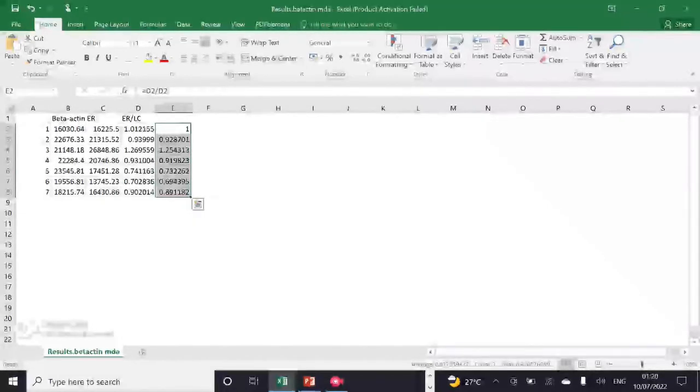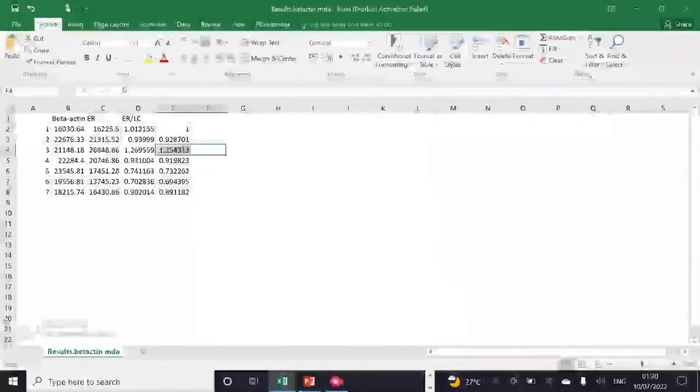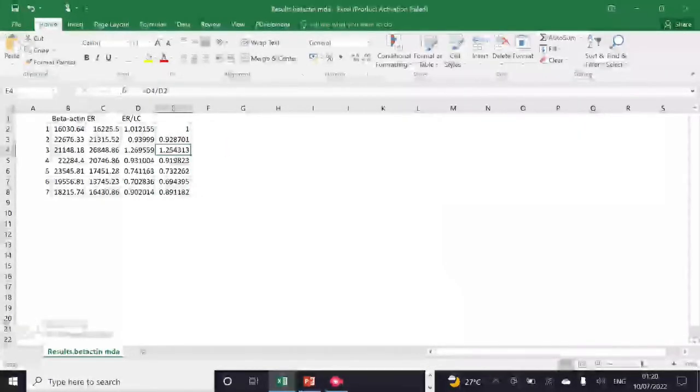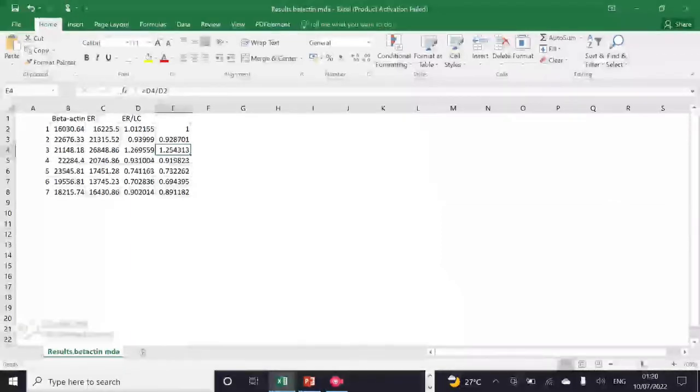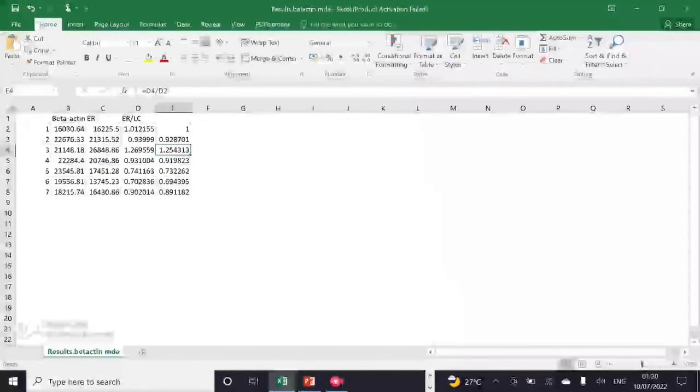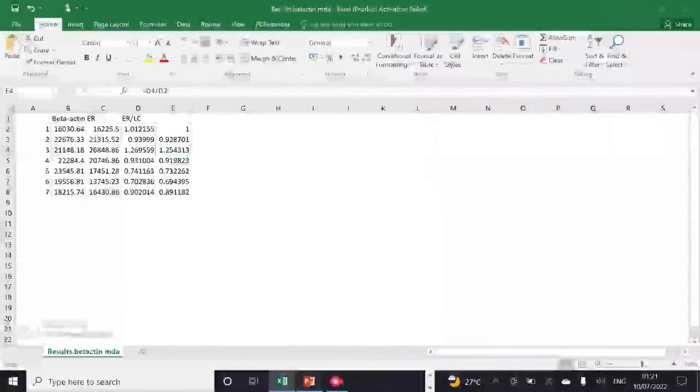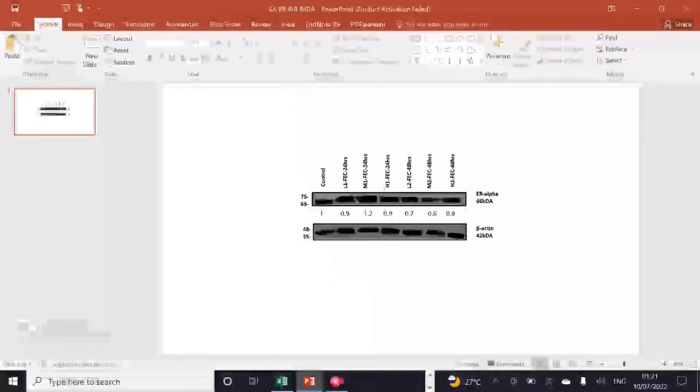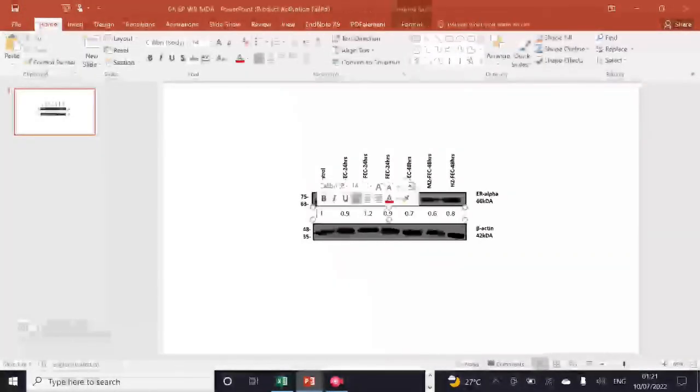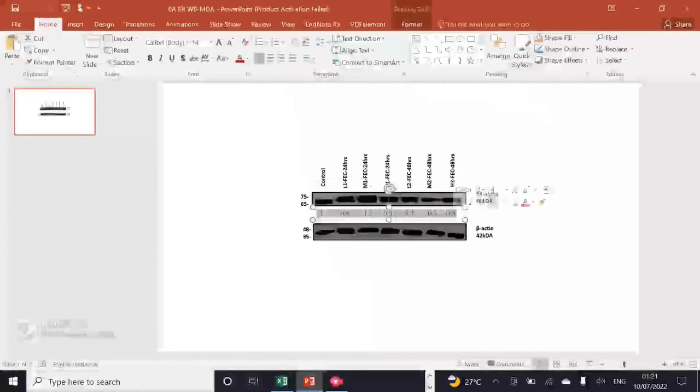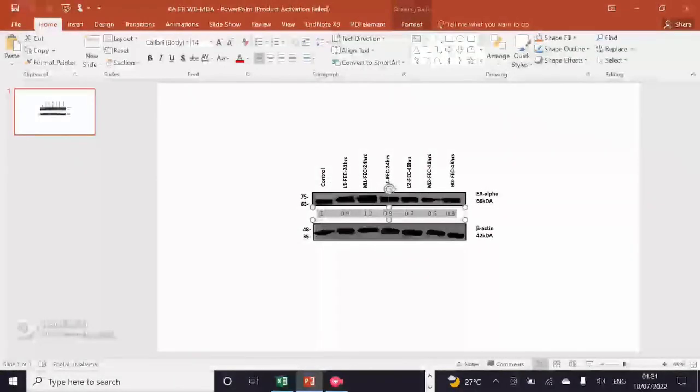After getting to this data, you will set this data like this in a PowerPoint file. You can see that my data is exactly aligning with my experimental data. The control is having one value, my second treatment group is having 0.9.